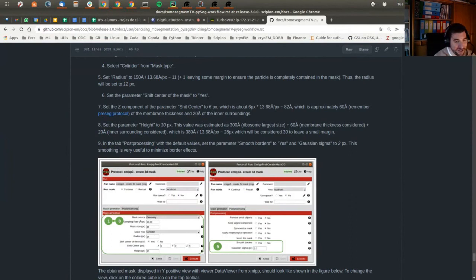Okay, thank you, Antonio. Regarding the question of the imagery, if you pick each plane around an axis, rotate everything and take the mean of all of this, in the end you have a plane. So the representative of each class will be a 2D image. That's why it's a 2D classification. And again, correct me, Antonio, if you think I'm wrong, because, as you have said before, you're fresher than me.